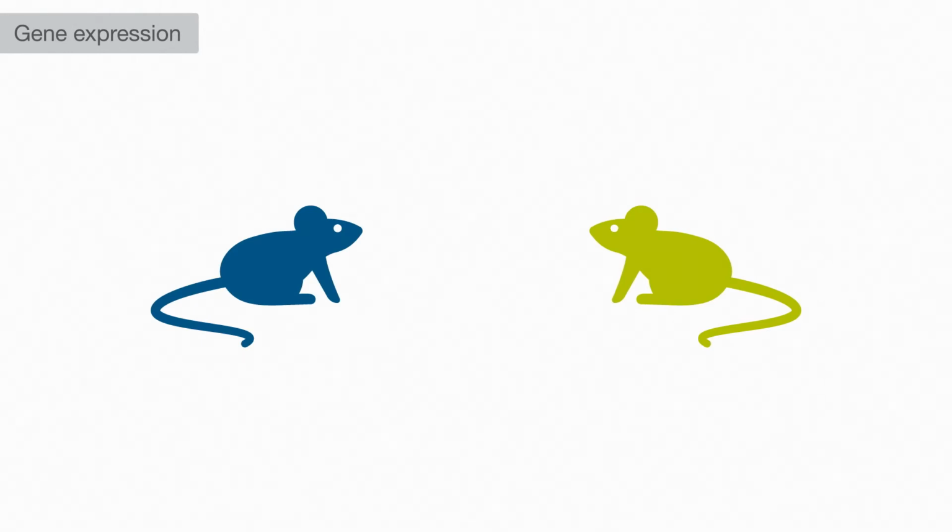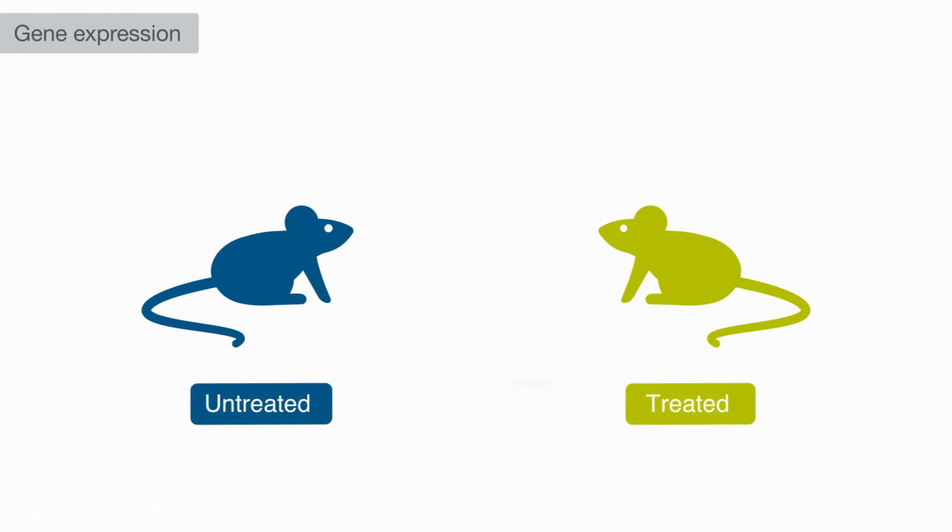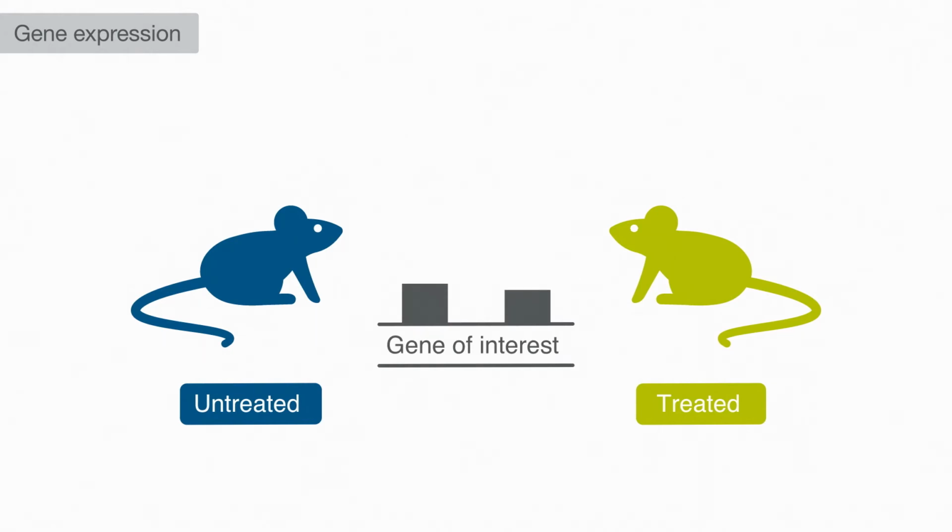Did you know that qPCR can be used in a variety of different applications and research areas? Let's talk about some of the most common ways that people use this awesome technology. Most notable on the list of applications is looking at relative expression levels of different gene targets. Researchers compare two or more samples, say cells from untreated and treated animals, to determine if and how much the expression of their gene of interest is changing.